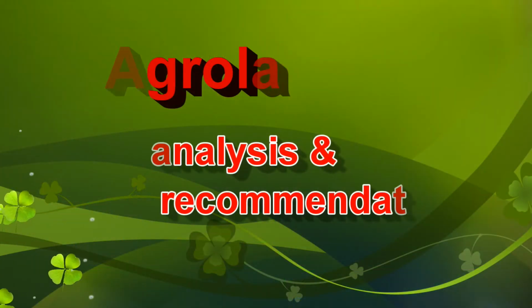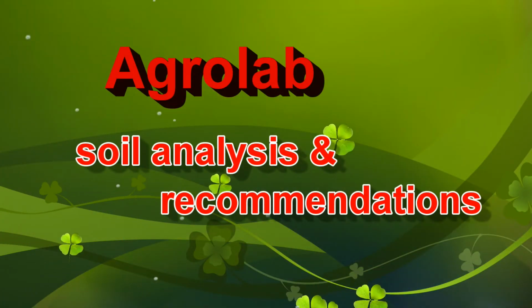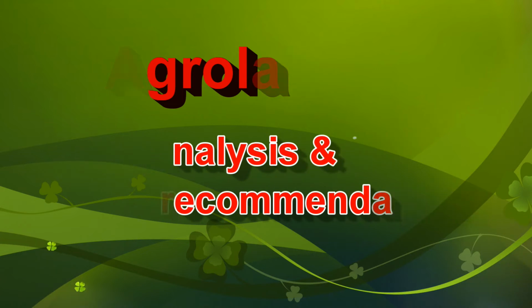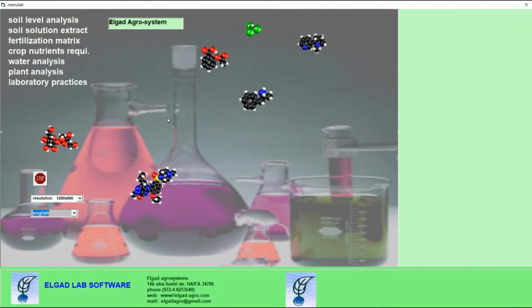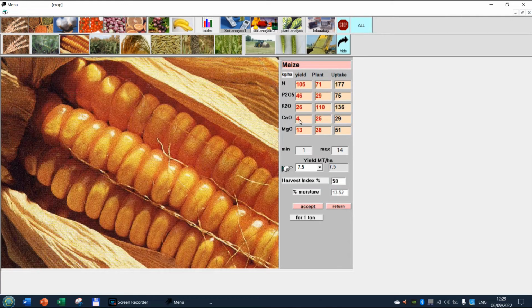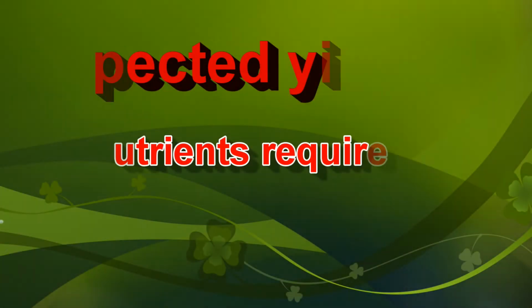Agrolab is a software of lab analysis and recommendation for fertilization. Let us start, for instance, with one of the crops from the cereal. Let us test the maize.